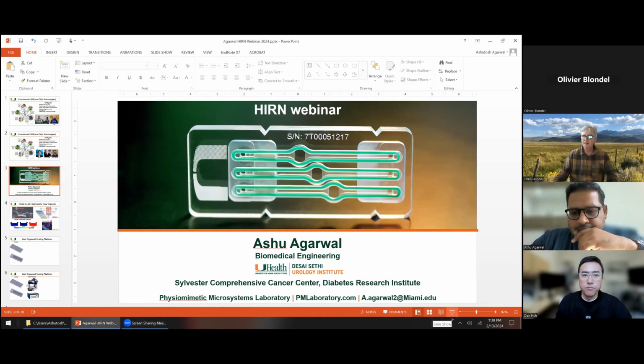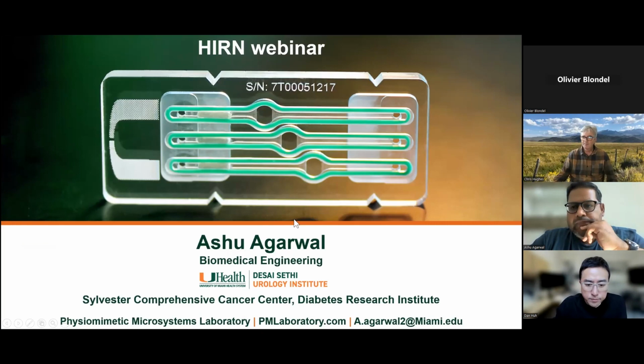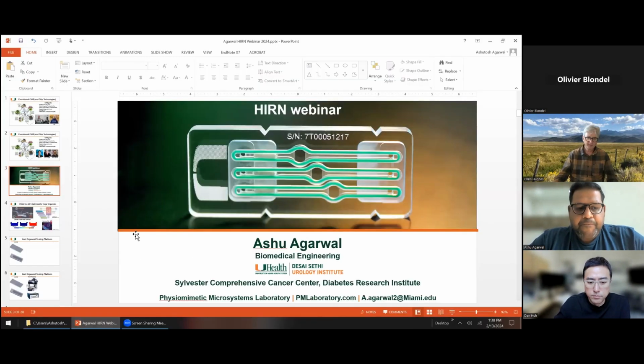Yeah, the first one, how do you manage the variability? That is a problem any time you try and do work in the laboratory. In clinical trials, we use hundreds of patients, which captures that heterogeneity. What we've mostly tried to do is to establish the platforms with well-validated cells so that you can reduce the number of variables. Once you've got a platform that works and you can believe in, you can then start taking cells from different patients. And we're beginning to do that by using stem cells.